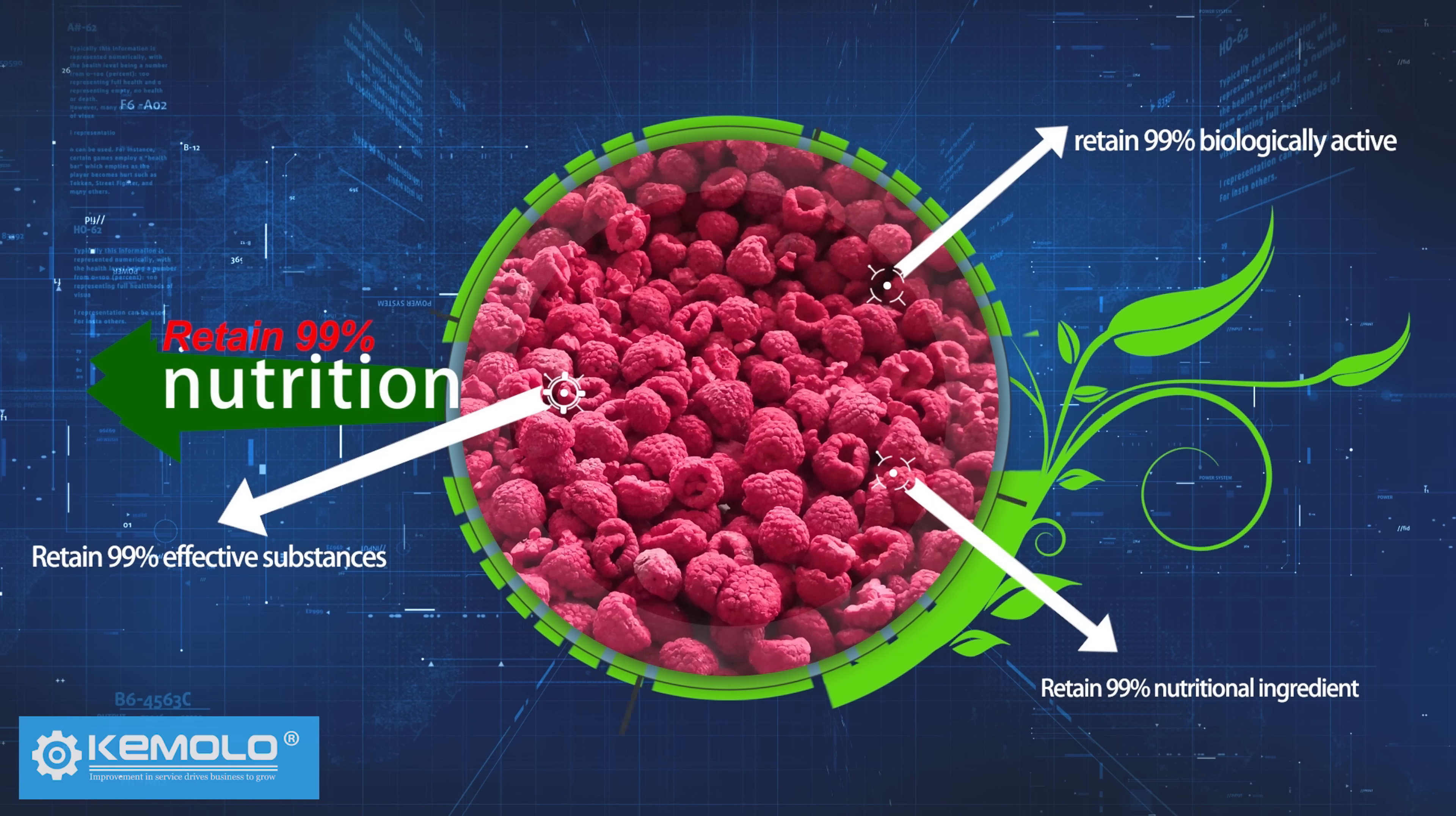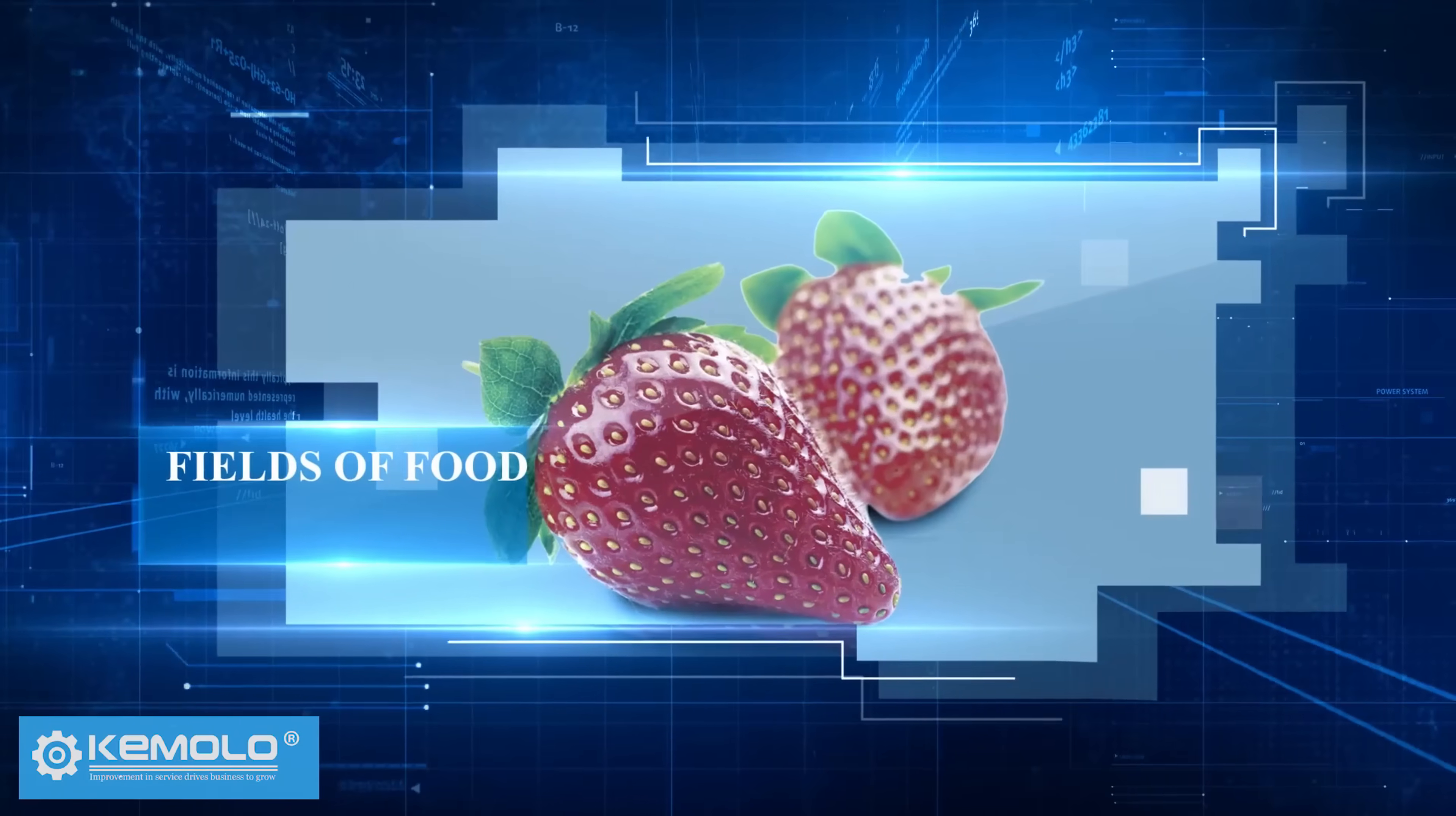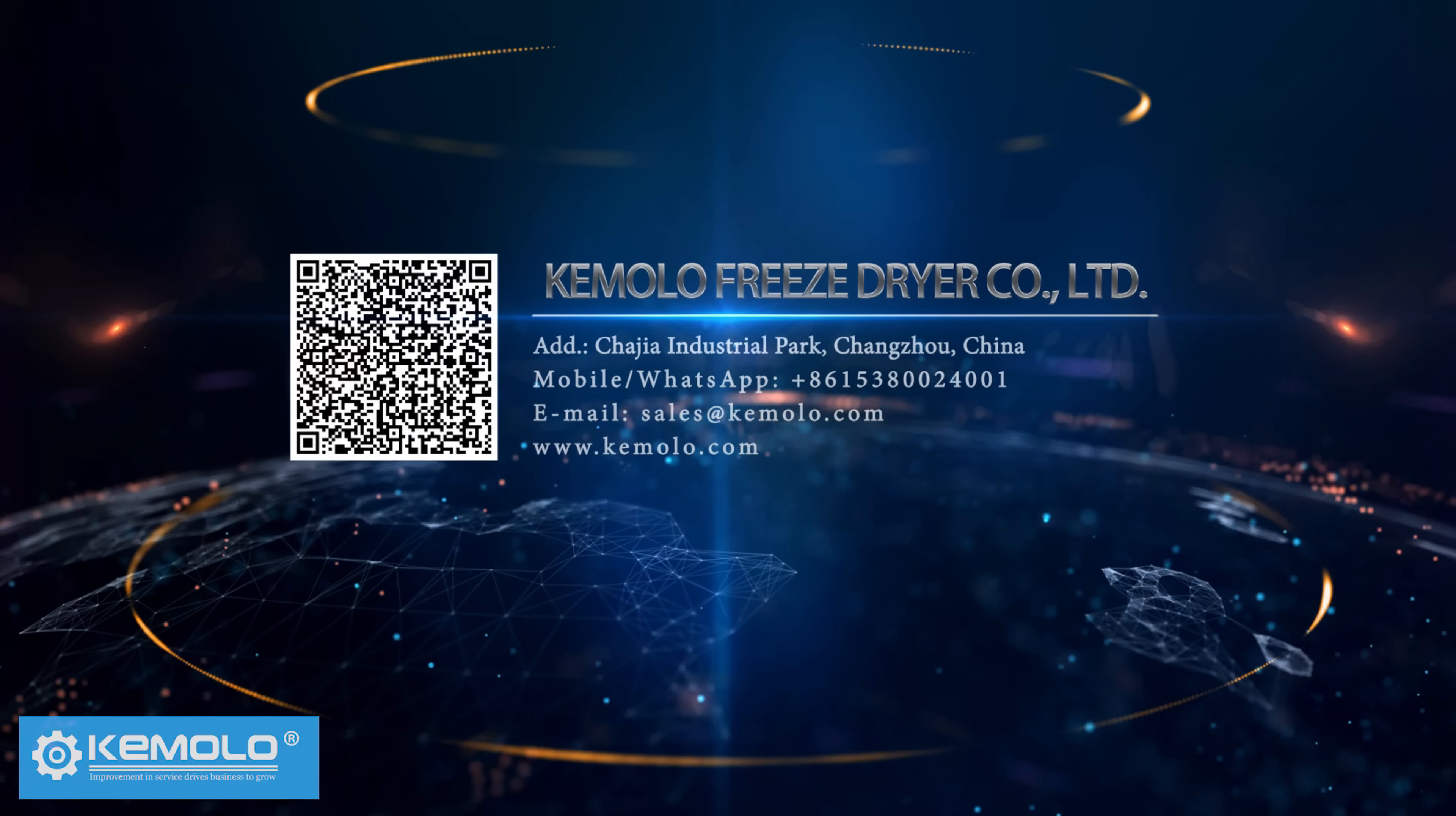Biologically active or effective substances are preserved. Freeze-drying technology is the most promising technology in the fields of food, medicine, and biological products. Investors are welcome to contact us for consultation.